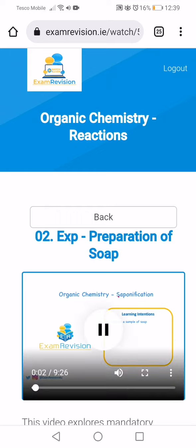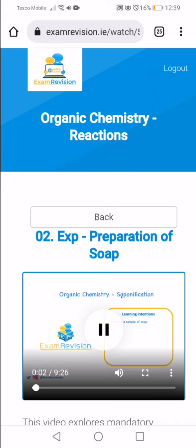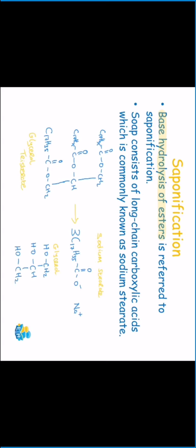Organic chemistry, and we're specifically going to look at saponification. Our learning intention is to prepare a sample of soap. So to start, saponification can also be referred to as the base hydrolysis of an ester. And soap consists of long-chained carboxylic acids, which is commonly known as sodium stearate.